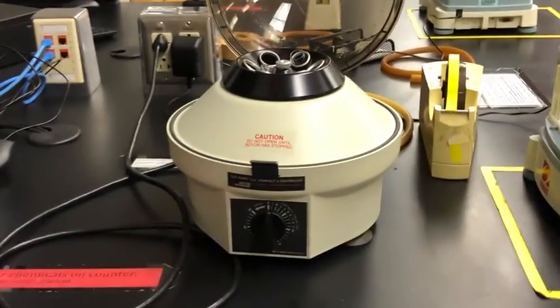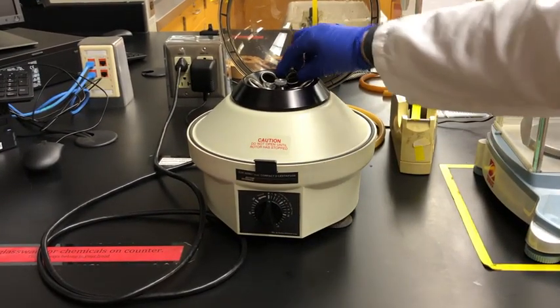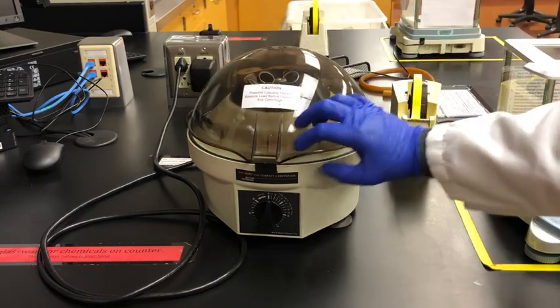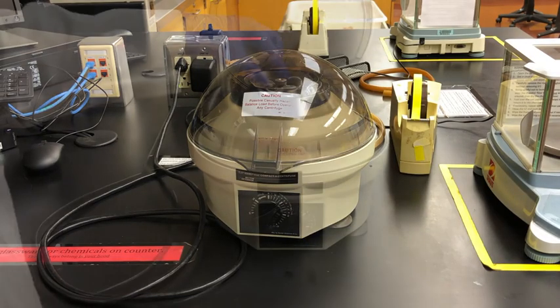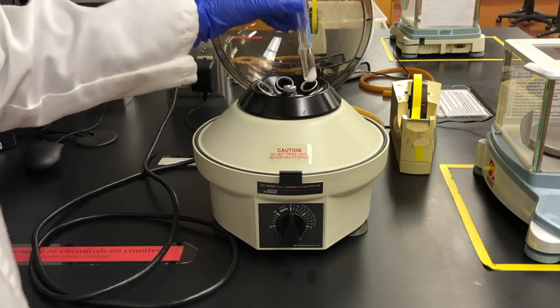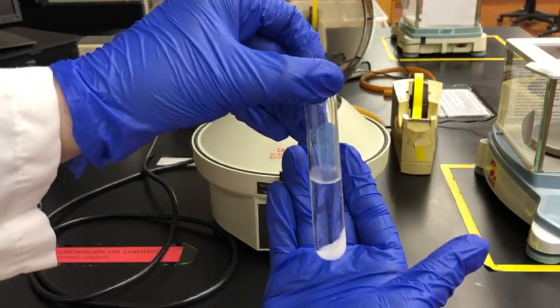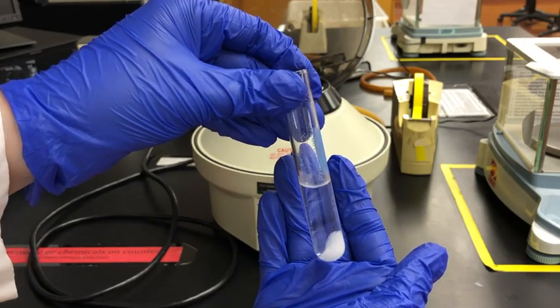Now we're going to use our centrifuge again, and this will allow us to separate the rinse water — the liquid we just added — from any solid. Once the centrifuge is done spinning, we've got our solid at the very bottom of the centrifuge tube, completely separate from the liquid at the top.